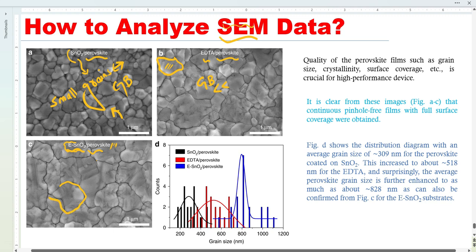We can see that the grain sizes increase significantly and this can be reflected in this blue diagram. This blue diagram basically shows here on the y-axis we have the counts, meaning number of counts. This means that in this C sample, we have almost seven grains available at almost 800 nanometers.